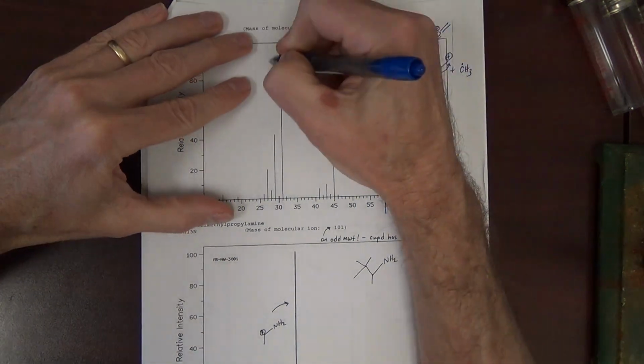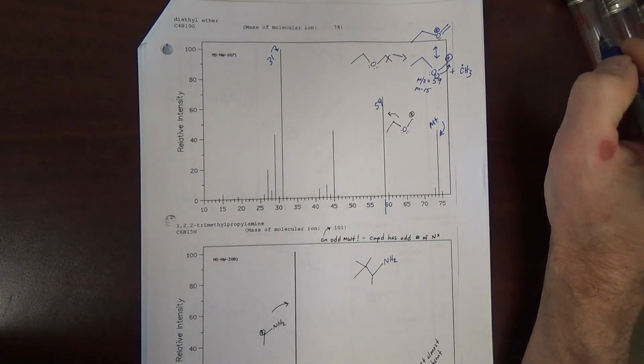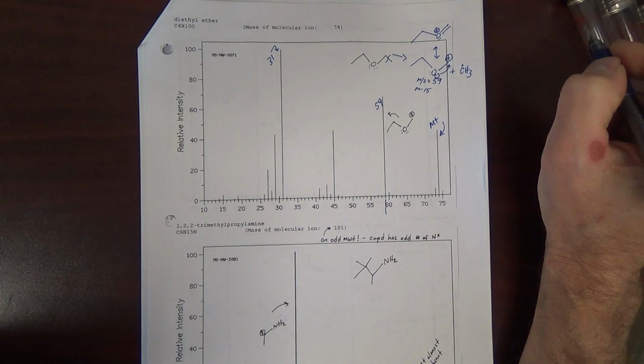What is the base peak? The base peak is 31. What could 31 be? Actually, I'm not quite sure what 31 is, and that's kind of odd here.